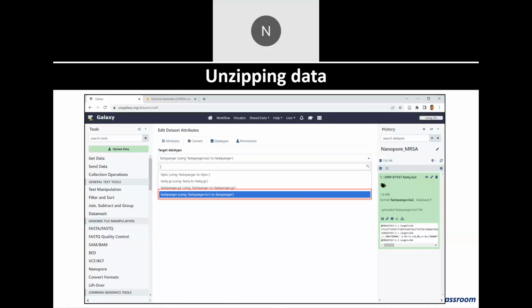Class? Yes, sir. Okay, so because the time is less, we'll go a little fast, but of course, in case you get stuck, you let me know. And then, of course, I've also already shared the link with you. You practice at home, because if you do it online, it is going to take 5 or 6 hours to finish because of the speed and the data that we have is large, right?